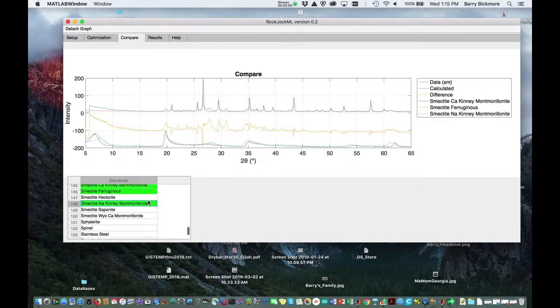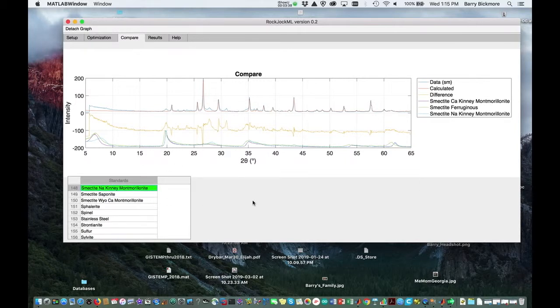Anyway, this page is going to be a lot more elaborate later on, because we're working on developing some tools so that we can bring up suggestions for you to try for different minerals to put into your analysis. And that'll be based on peak positions, but also on which minerals are likely to occur together and things like that. So stay tuned for that.